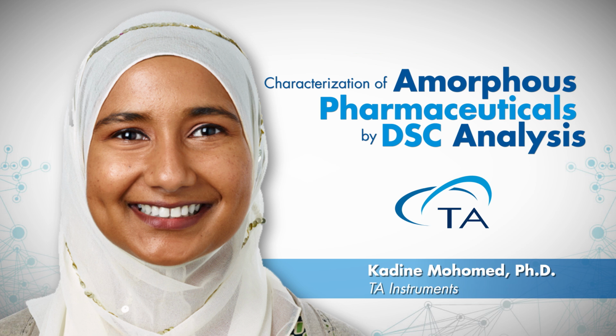A lot of the pharmaceutical powders are very low density, so they're fluffy and light, and may even have some static effects. So when you have a very fluffy, light powder, you're not getting a whole lot of mass into your DSC pan. You may only be able to fit something like 0.5 milligram of sample into your DSC pan, just taking up that volume. The powder prep tool, which uses a funnel and a plunger, really allows you to compact your powder samples into the DSC pan, allowing you to get more material in there, more mass, so therefore being able to get more heat flow associated with the transitions that you're looking for. Okay, great. Yeah, I agree. It's a great tool. Okay, next question.